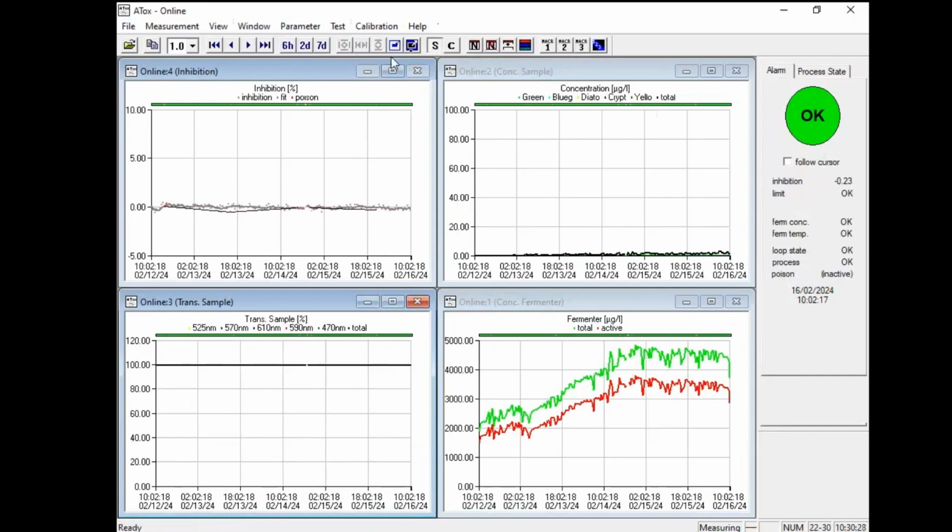So with this, you can zoom in, zoom out, the Y and the x-axis, the time axis, and with this automatic scale of the y-axis you come back to the normal display here. Okay, here you see a C. The C is comment.